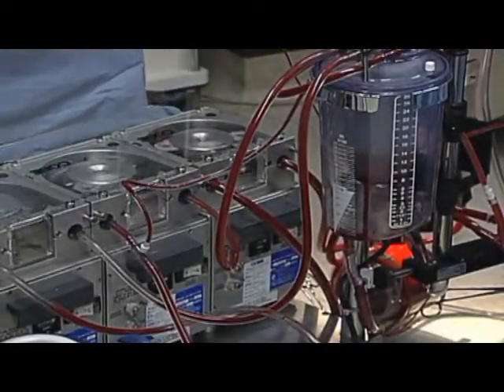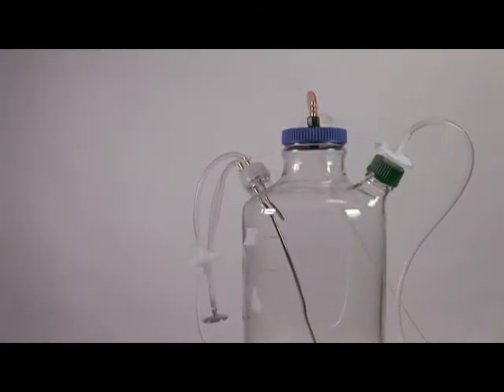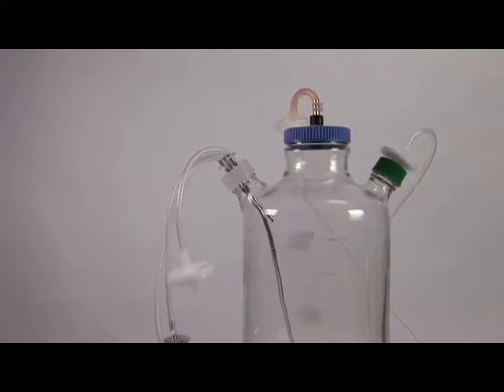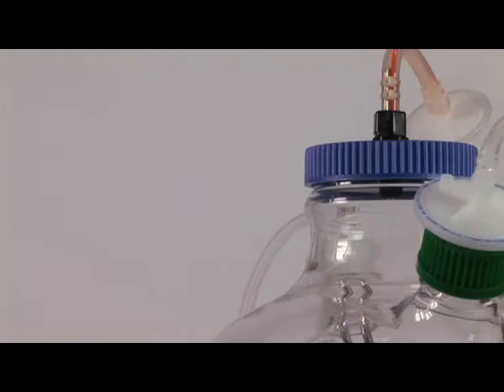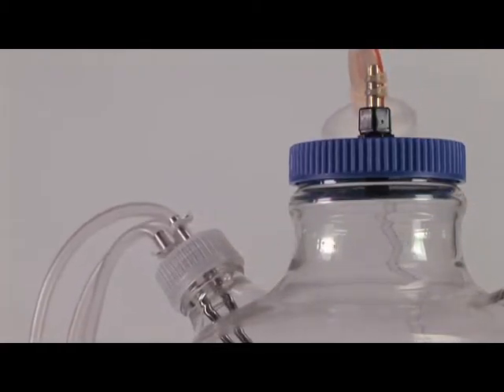Biopharmaceutical manufacturing seems to present an endless list of needs for aseptic fluid transfer. Traditionally you cobbled together a variety of tubing types and barbed connectors purchased from different suppliers and held it together with tie wraps. Once assembled it had to be autoclaved in-house with a validated process or sent out for sterilization and validated. Then you had to hope that none of the tie wraps fail, leaking your valuable liquid and jeopardizing your product.